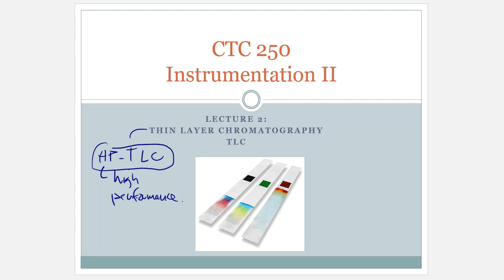So the HPTLC is actually some instrumentation, and the instrumentation is going to be able to do a lot of the thin layer chromatography applications for you automatically. So we're going to talk about that as well, because guess what? Our name says chemical technology, so we need to make sure that we talk about the technology portion, even when it concerns little bitty kind of special TLC plates that we were doing 50 and 60 years ago. So the technique and the types of things that we can do with TLC plates today because of HPTLC has really just completely changed the discussion that we have with TLC altogether.